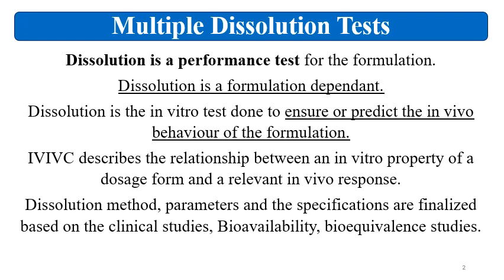See, the dissolution is a performance test for the formulation, and it gives the understanding on how the product will behave inside the body. That is, the dissolution is the in vitro test done to ensure or predict the in vivo behavior of the formulation from the in vitro data.